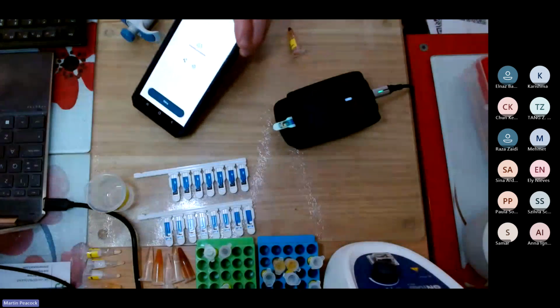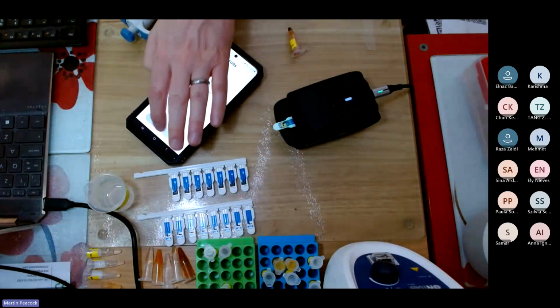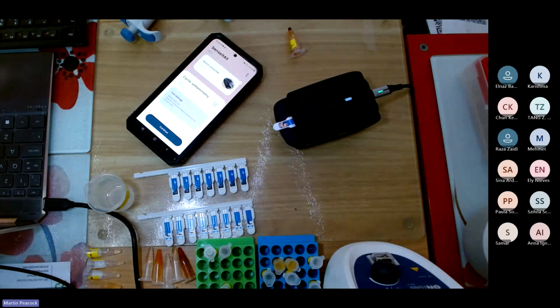So now it says the upload is complete, and I'll go done there. I'll share my screen with you. We'll flick over to, that was the caffeine data. Let's go up there and find that Sudan Red data. So let's just do a quick refresh here. There it is. And when it pops up, which it will, there we go.